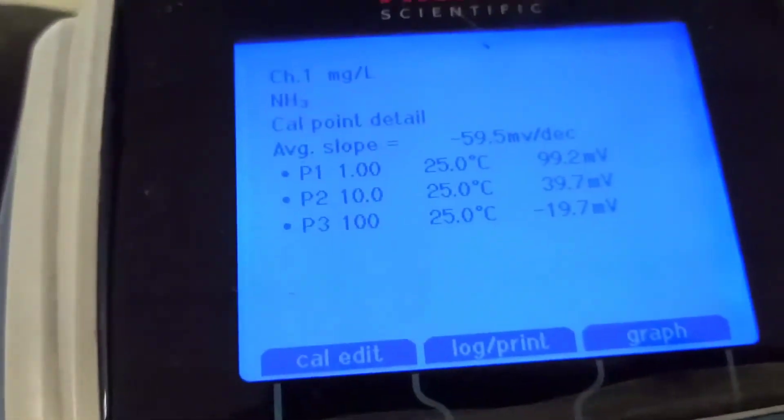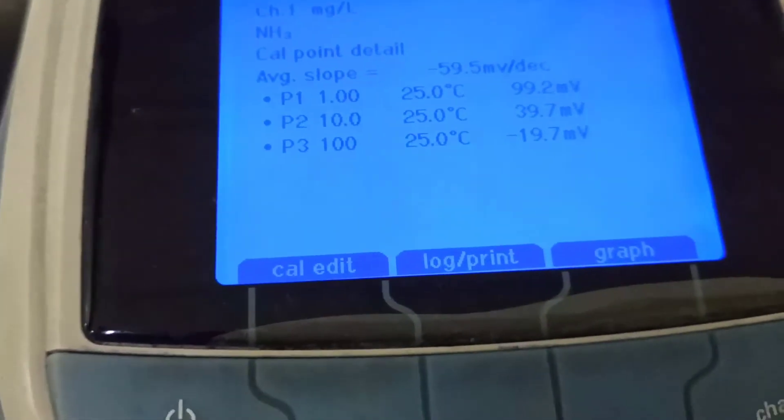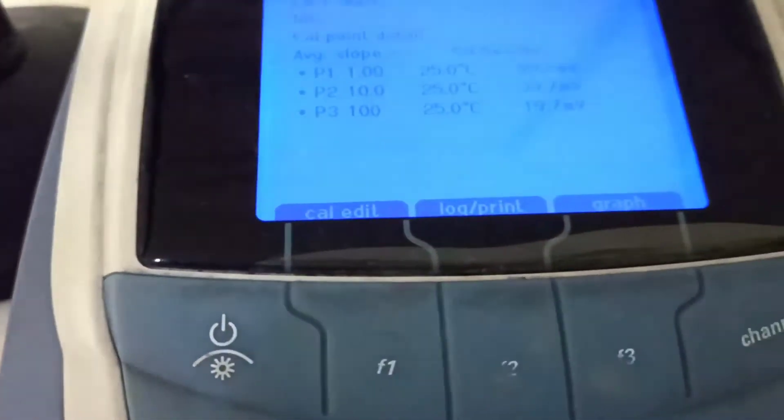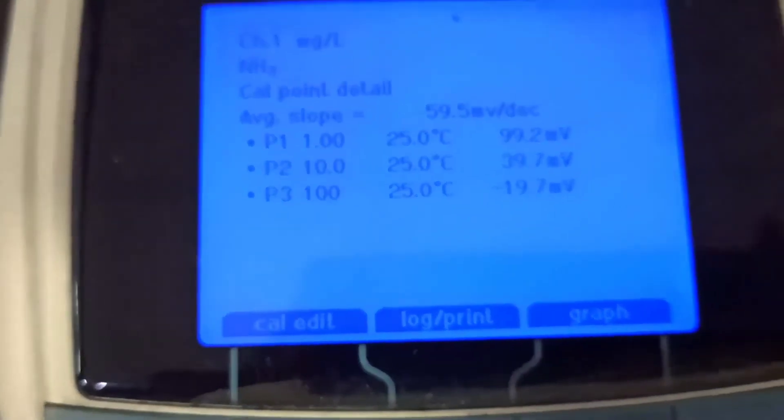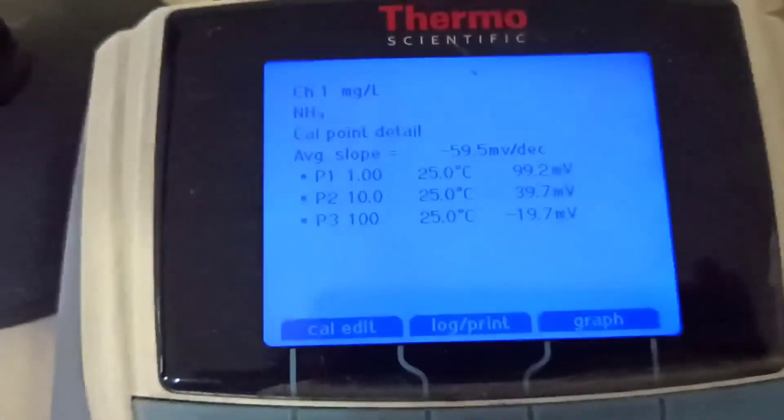We can see our average slope is minus 59.5 millivolt. That means our calibration is correct because the range is minus 55 to minus 60, and our average slope is within at minus 59.5 millivolt.